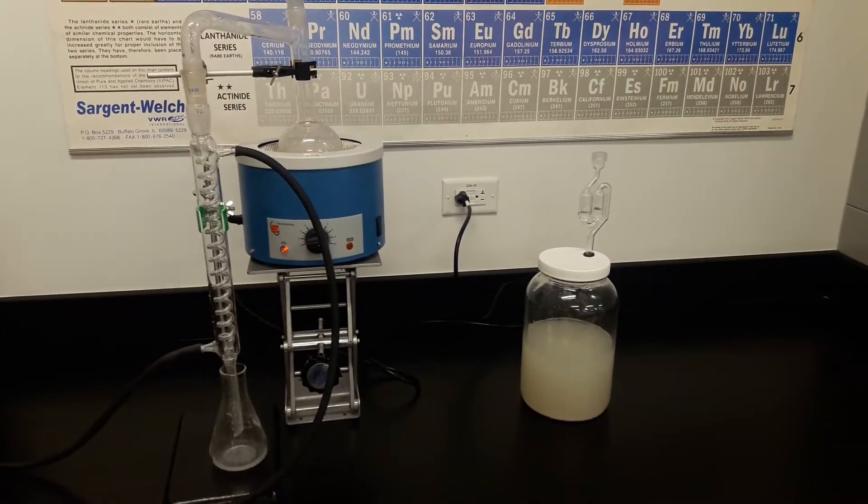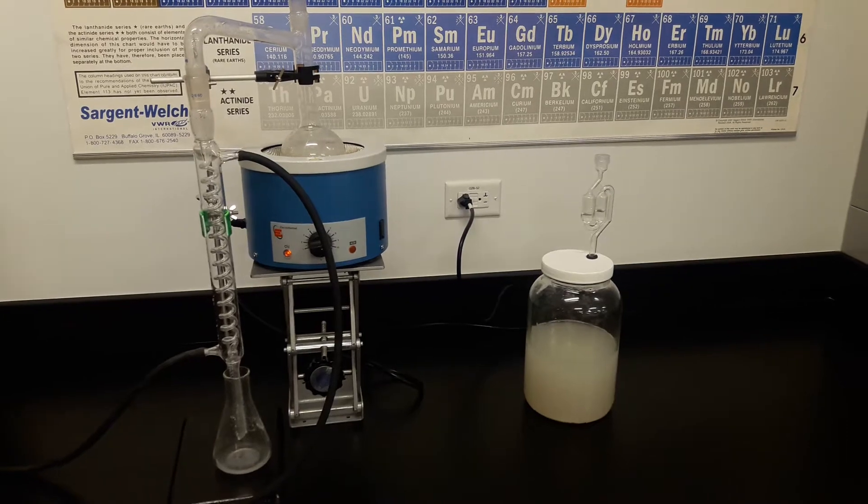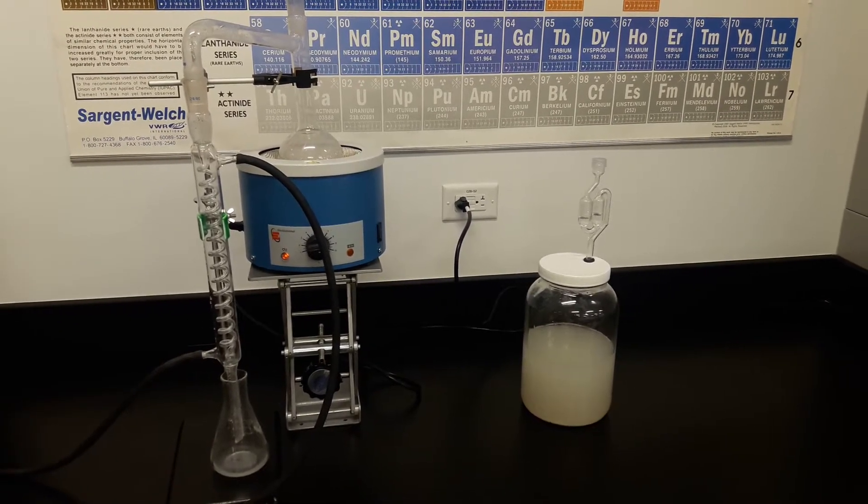This is our distillation apparatus. On the left hand side we've got the entire apparatus and it's currently creating alcohol.